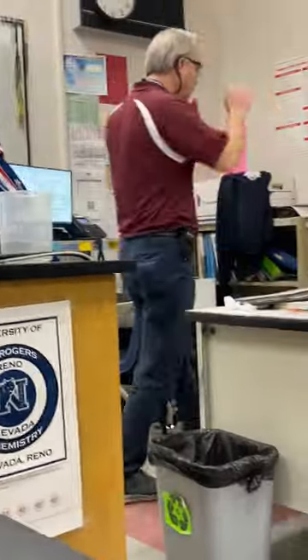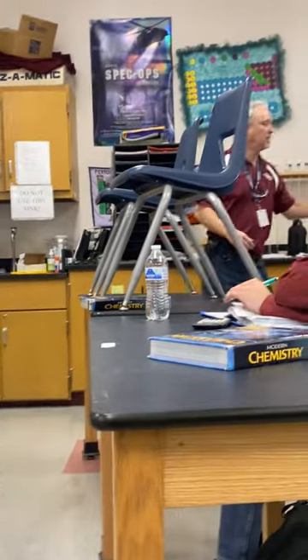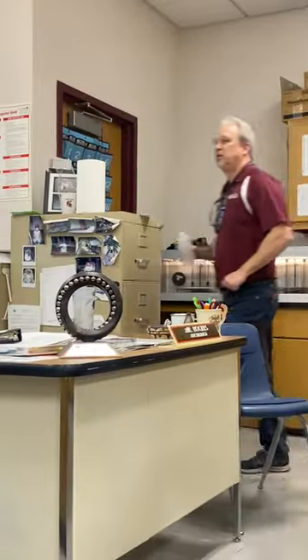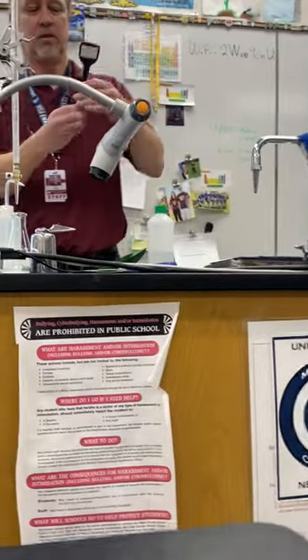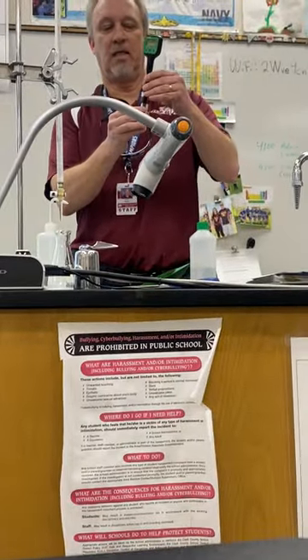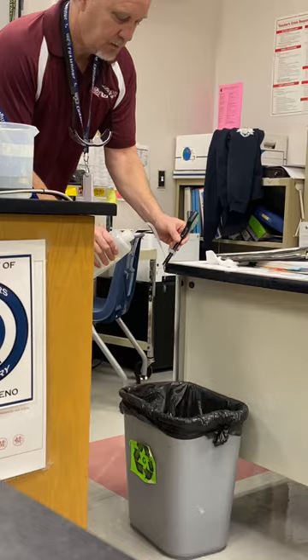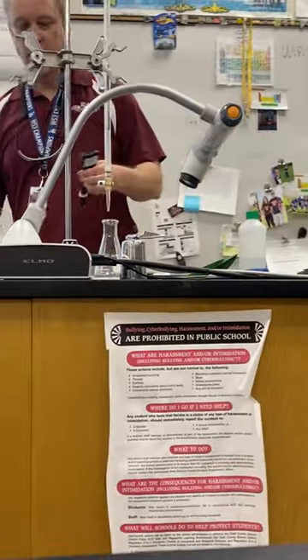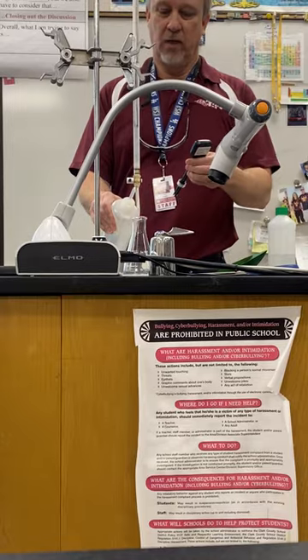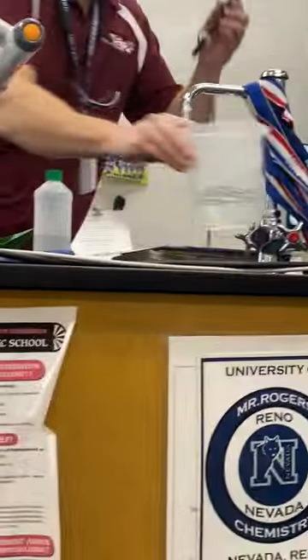Using the pH probe, what I have to do, let me get a squirt bottle, show you exactly what I have to do. So to use this pH probe, it's stored in a solution. So first of all, I need to take it out of the solution, rinse it out. Make sure it's on. I would probably want more liquid in there so I can actually submerge the tip of the probe.